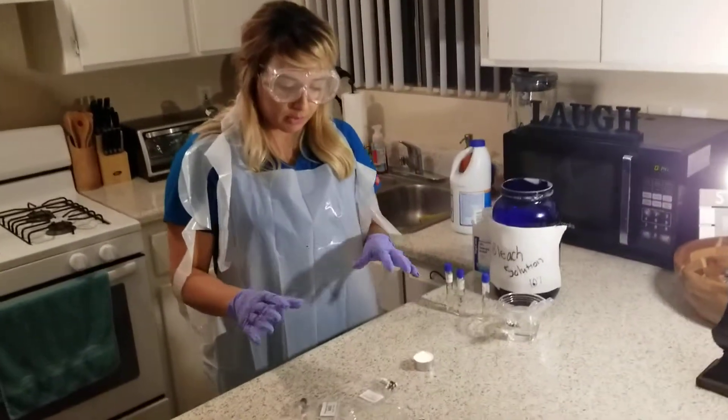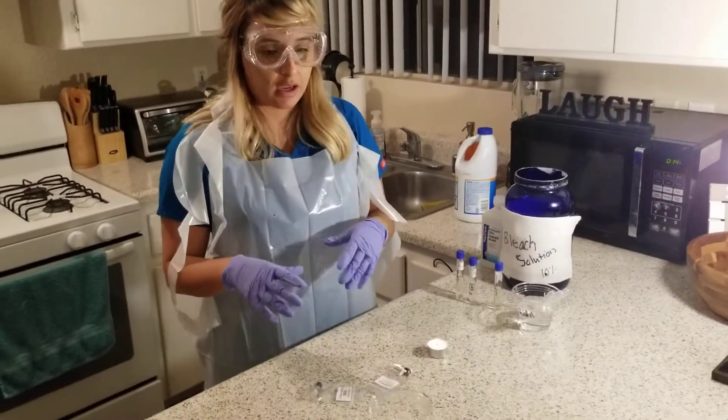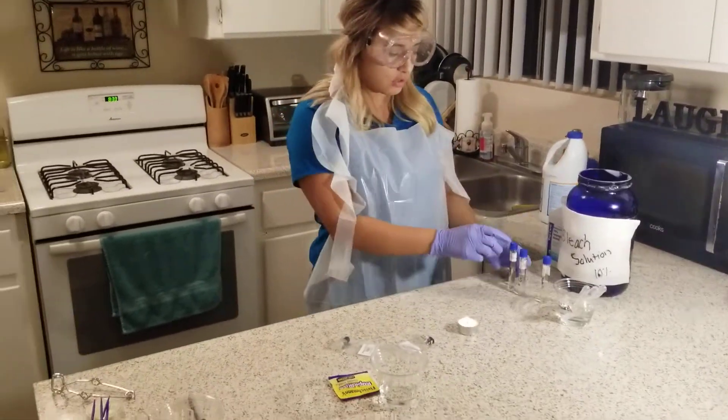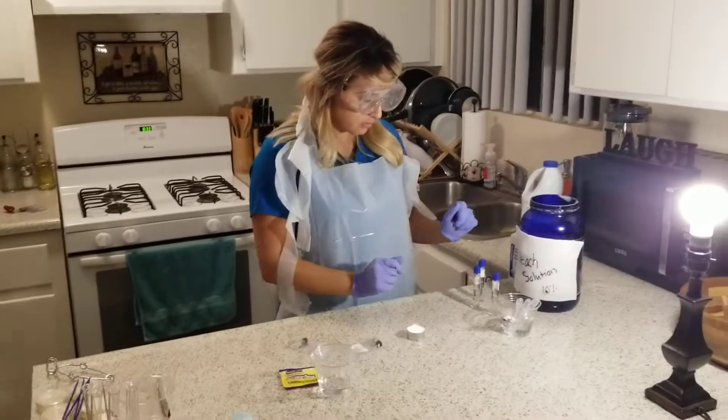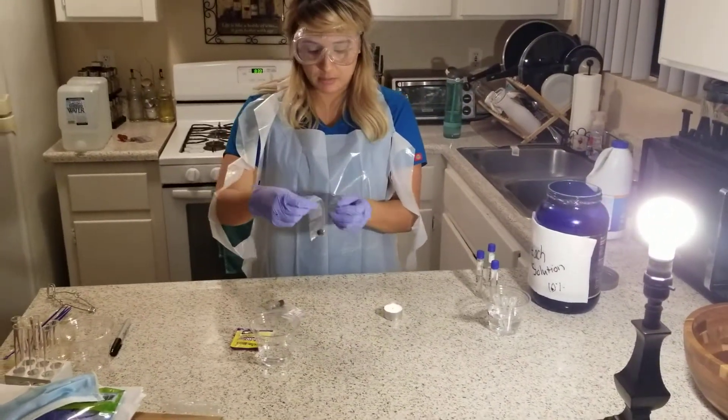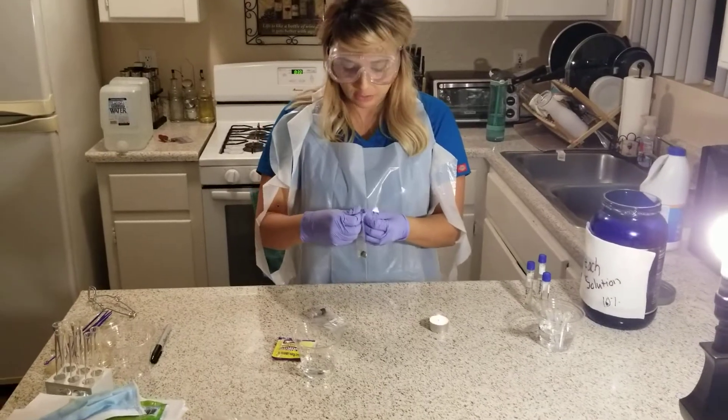So what I'm going to do is use the antiseptic techniques to transfer the cultures into a broth. First I'm going to start with the epidermidis, Staphylococcus.